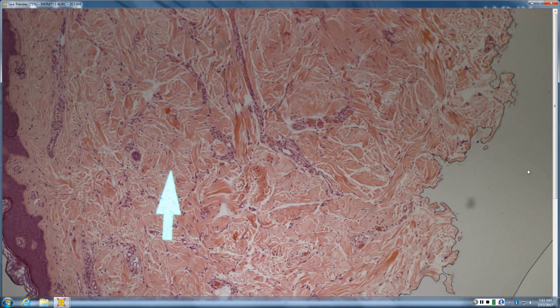Does this look like it's mainly collagen or mainly elastic? Mainly collagen. Do you know any type of collagenoma? Which connective tissue nevus is almost totally collagen with no elastic? Collagenoma. Yeah, which is shagreen patch of tuberous sclerosis.